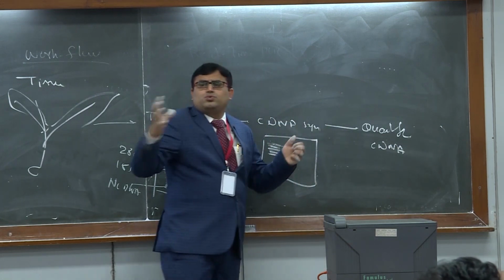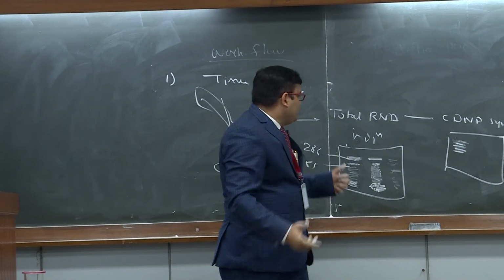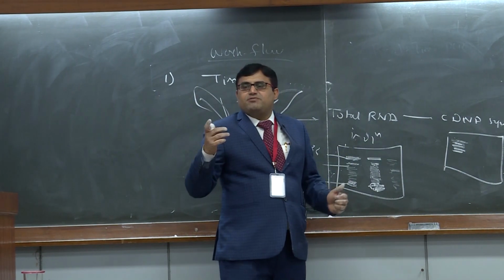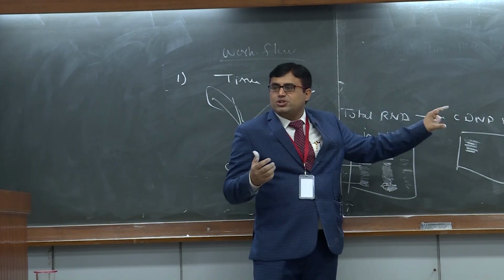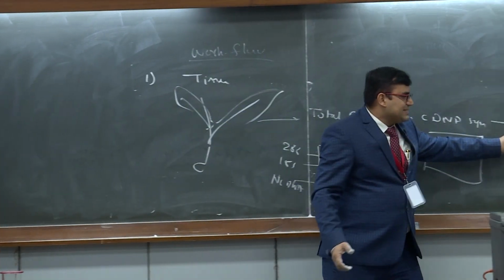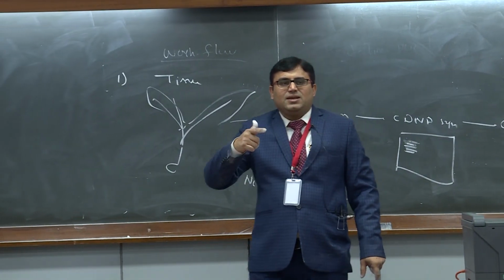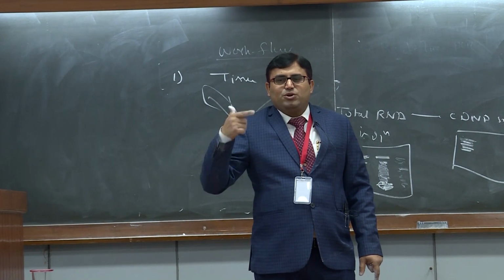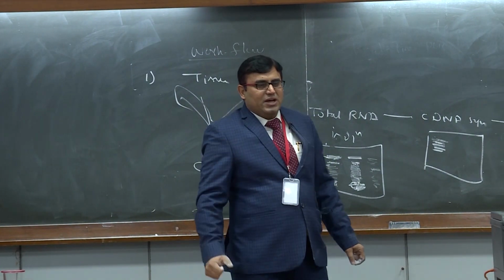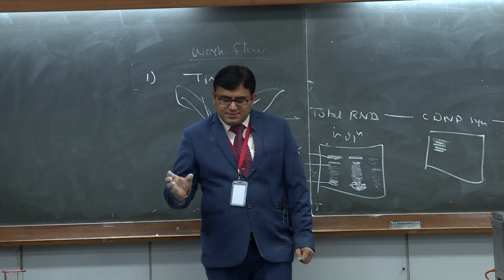Now, there are two schools of thought. One group of researchers prefer to quantify at the RNA itself, and then once they quantify, they will take equal concentration of RNA. There is another group who loves to quantify at cDNA, and then they will take equal concentration of cDNA for the reaction. Now, you have to tell me why there is a need to take equal concentration of RNA or cDNA. Expression?